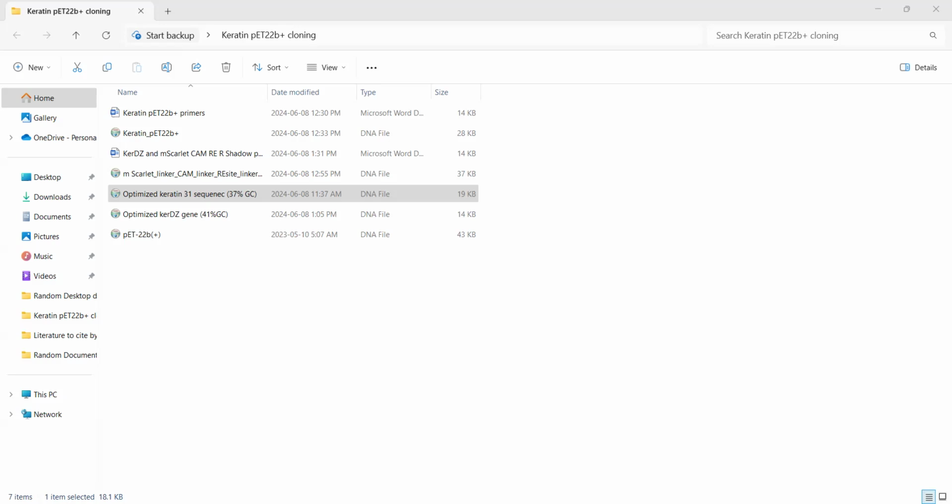Again, we need to go to this NEB calculator. Okay, 67. And then we go to the end. Oh, I apologize. I'm amplifying all of that. Yeah, my bad. I didn't realize that I have to amplify everything. So you need to amplify from here. This is where your primer will go. Let's do like a 27. Control copy.